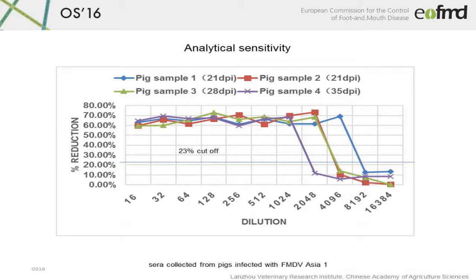But in a sense, you can see it has a wide range in the test, which means the sensitivity is acceptable. It's good enough for us to do the further test, because from 1/16 to quite a wide range, which means the sensitivity is good.